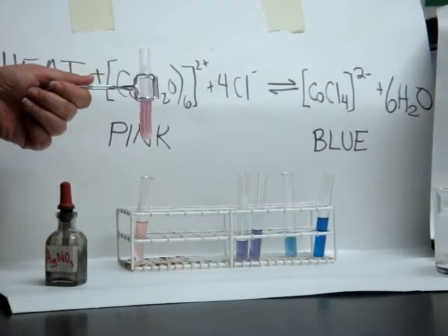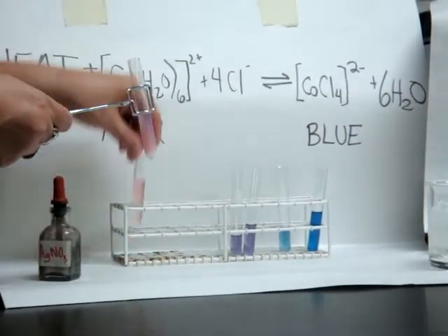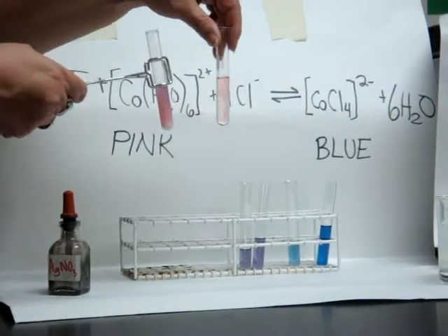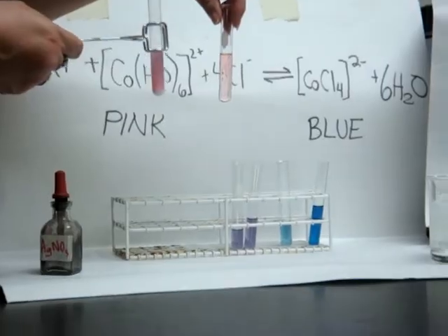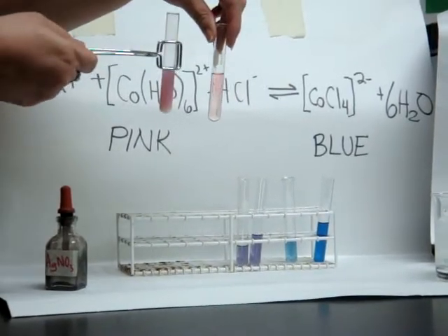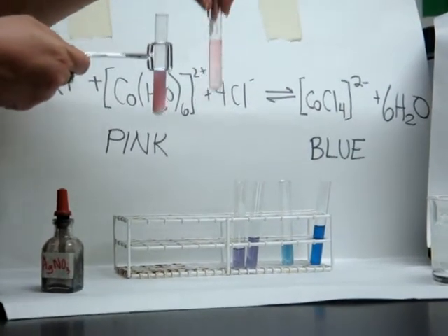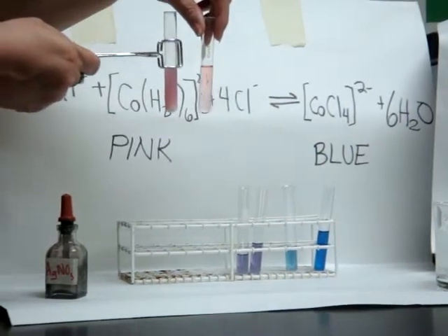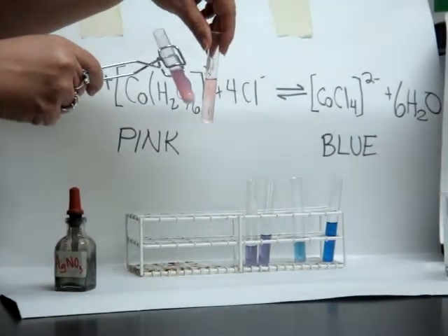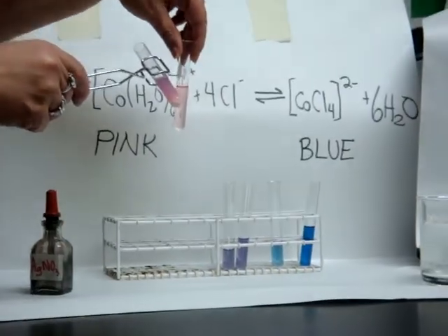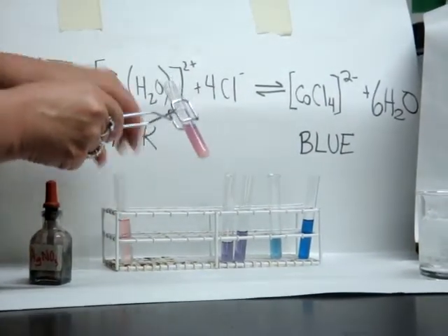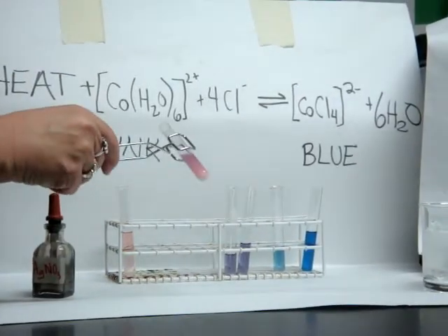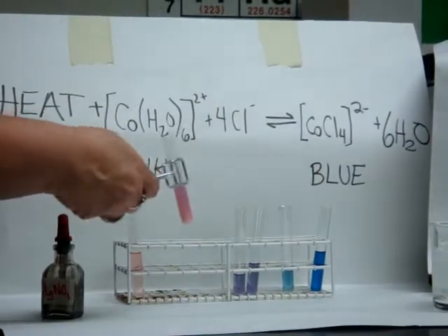Oh, what happened? Shifted to the left. Shifted to the left but there's something else going on. What's different about it? It's darker. Cloudy. This is very clear. This has got a little opaque and there's some stuff on the bottom. You see it? There's a little white stuff on the bottom. That's important. You might want to write that down. It's cloudy. It turned pink and it had a pile of white stuff on the bottom.